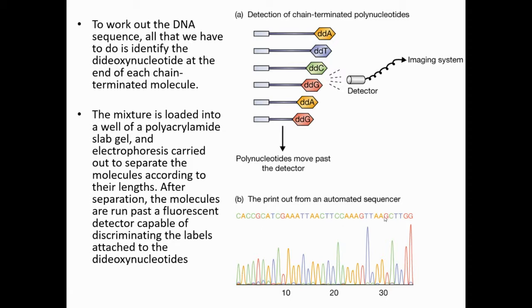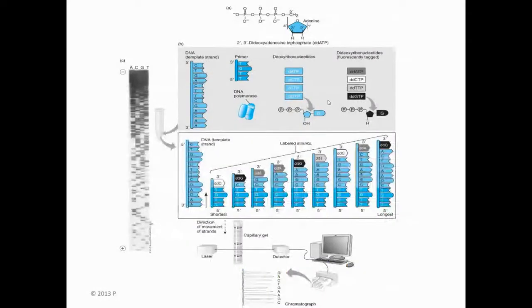So this is the technique they developed in the late 90s, using fluorescence plus gel electrophoresis, so that you can read the sequence automatically. That's also shown here.